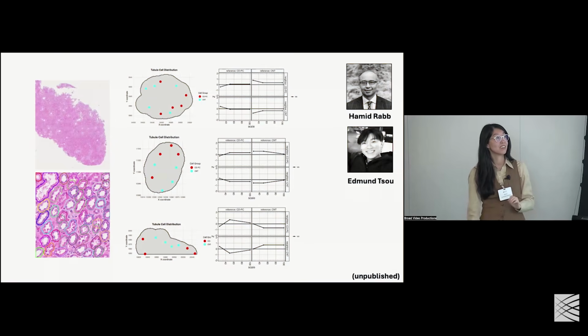Those questions, again, we can begin assessing by combining these tools in combination with other computer vision segmentation or domain detection approaches. So in general, I encourage you to think about how you can use these tools, in combination with other tools, to build up interesting statistical analyses.